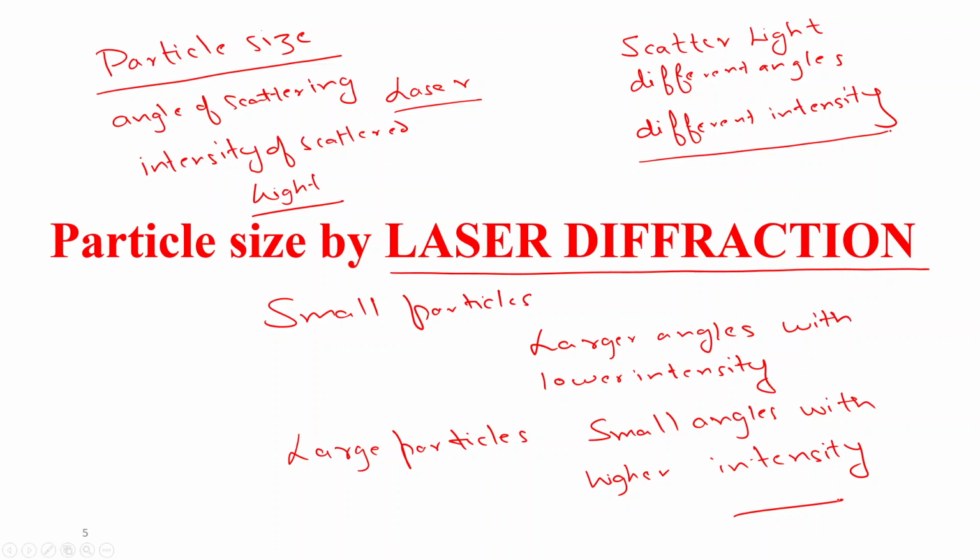Now this is the basic principle of determining particle size in a solution by laser diffraction in any of the instrument.